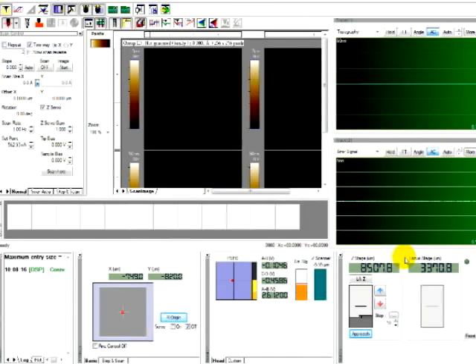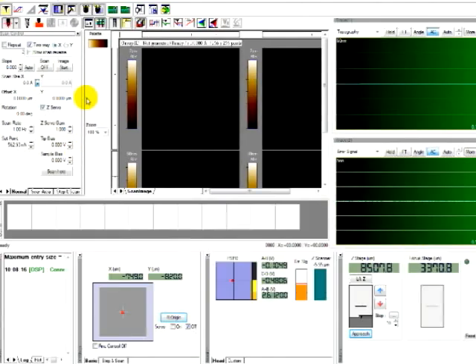Whether in contact mode or non-contact mode, you ought to know how to align the laser and also do the PSPD alignment before doing it. So make sure you know how to do it. Okay, so we'll show you in contact mode first how to control the parameter setting.